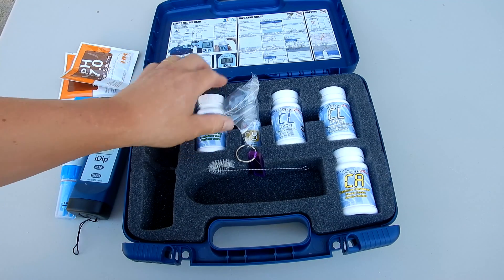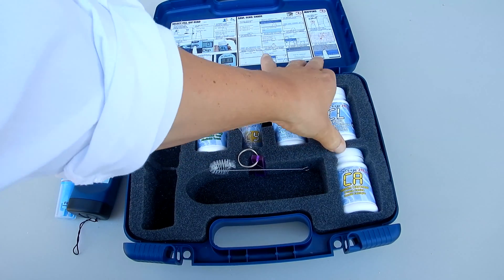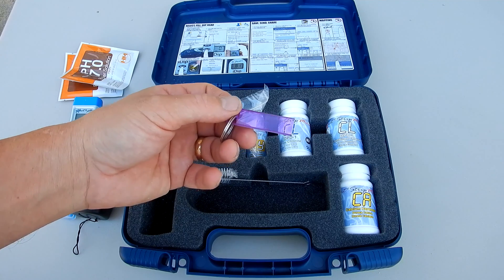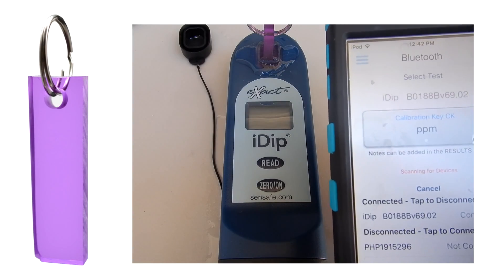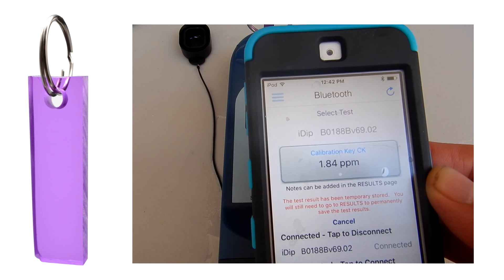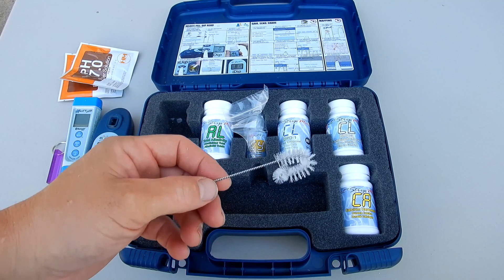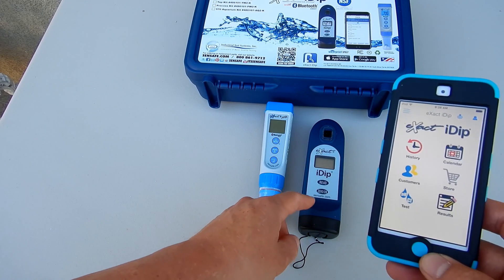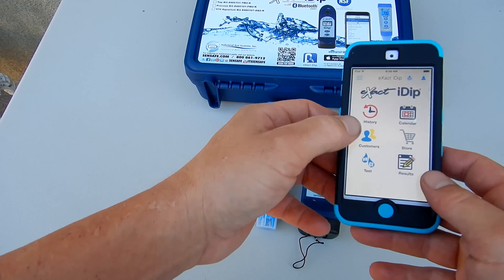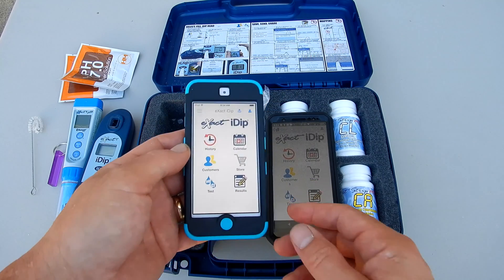Then you have your test strips for total alkalinity, your reagent for cyanuric acid, your test strip for free chlorine, your test strip for combined chlorine, and the calcium hardness strips. Also included is the acrylic calibration key for the Exact iDip. Note that the iDip comes calibrated from the factory — the calibration key will give you a reference point. There's also a brush to clean out the Exact iDip photometer chamber. Once you link the Exact PH Plus and the Exact iDip to your phone through the Exact iDip app, you can do all the testing, get results, log your customers, check your history, and order more test factors for the app.